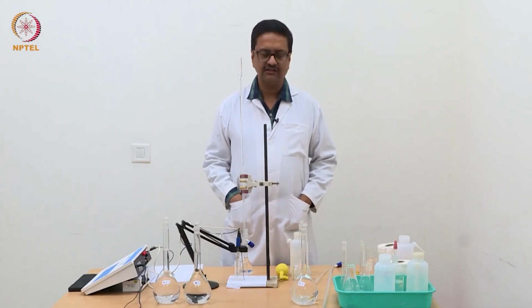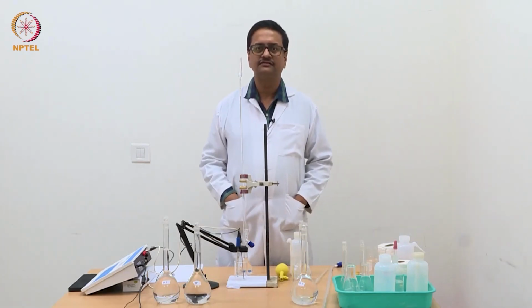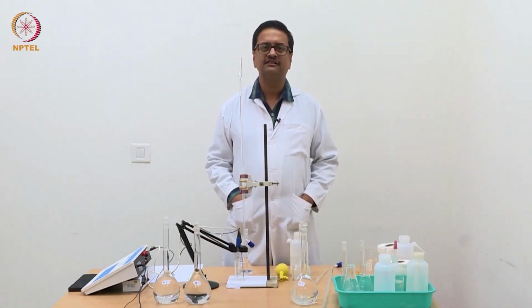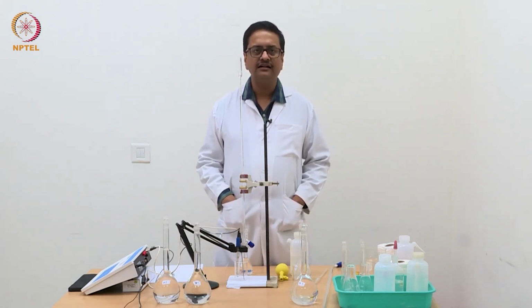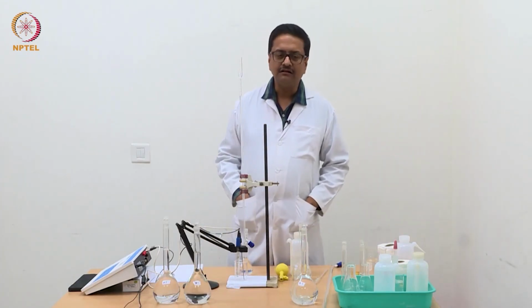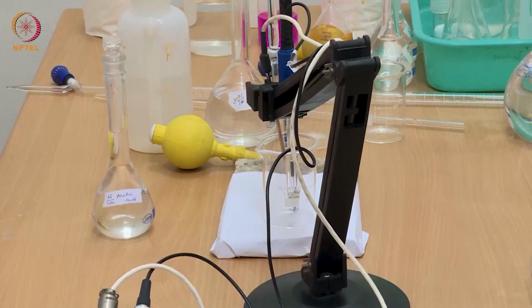Welcome back to this course entitled Elementary Electrochemistry. In the previous couple of videos, we have shown you a demonstration experiment of potentiometric titration of HCl versus NaOH. There we used about N/100 HCl and titrated it against N/10 NaOH, and we noted the change in pH with continuous gradual addition of NaOH from a 10 ml burette, and we saw that the end point was reached with about 1.6 ml.